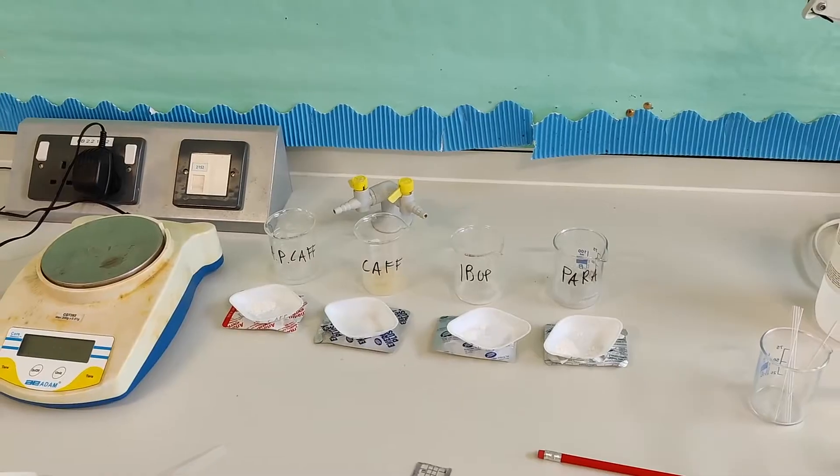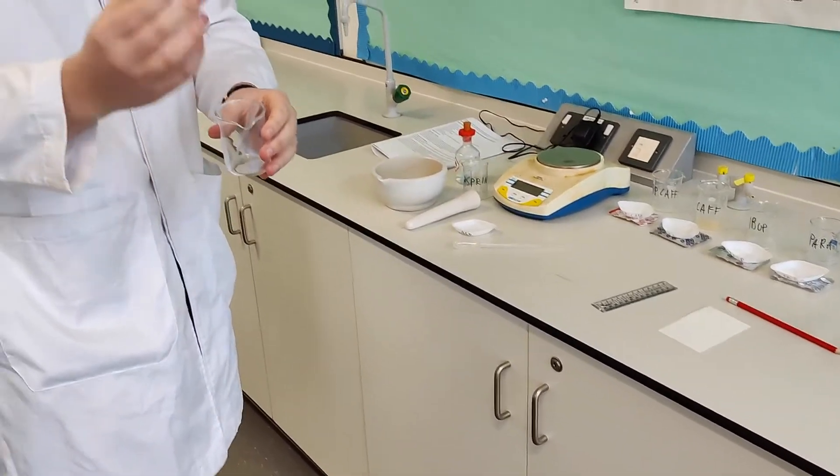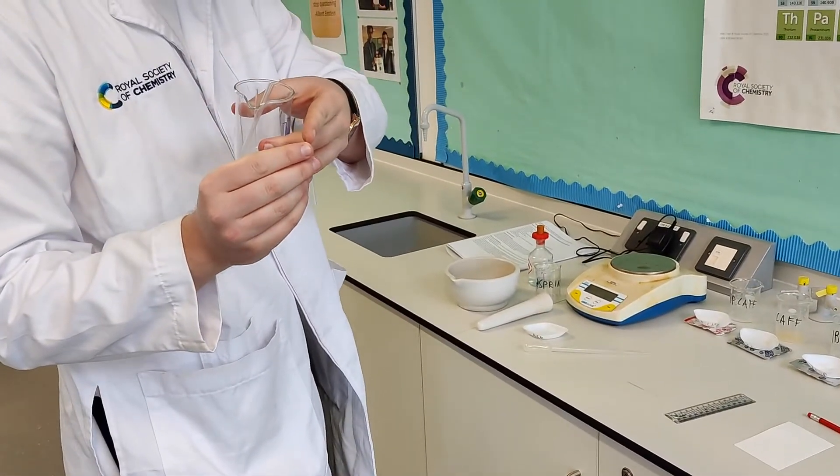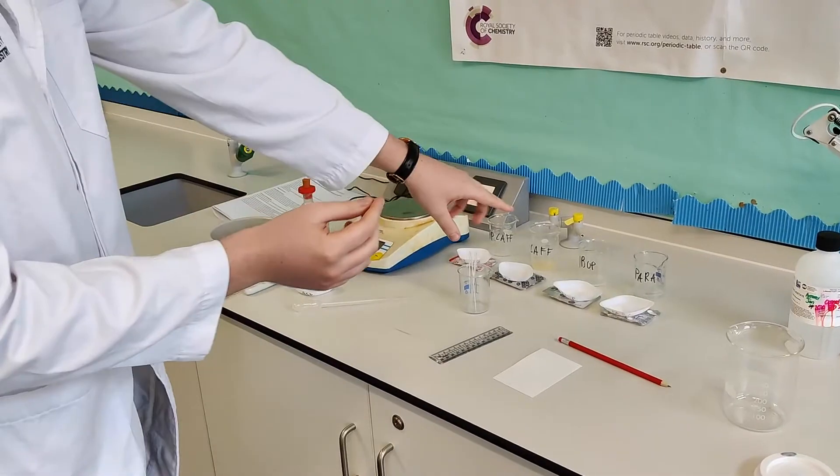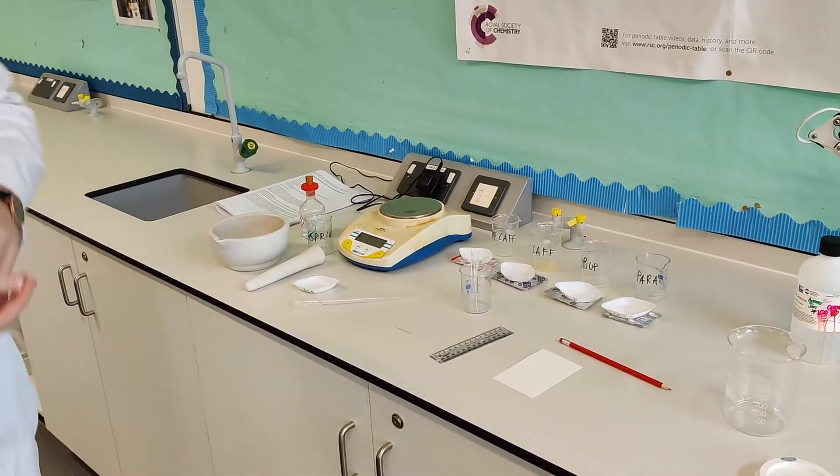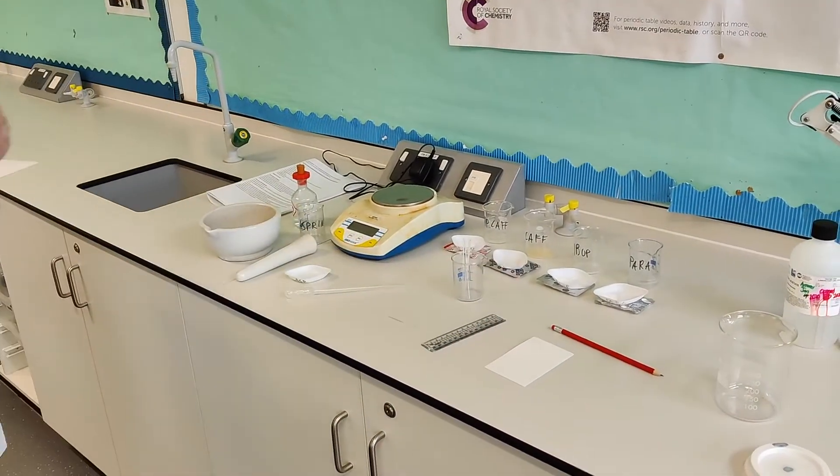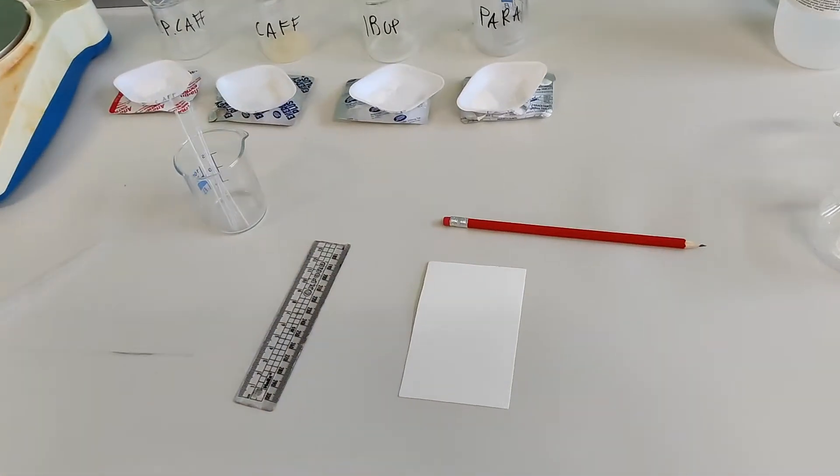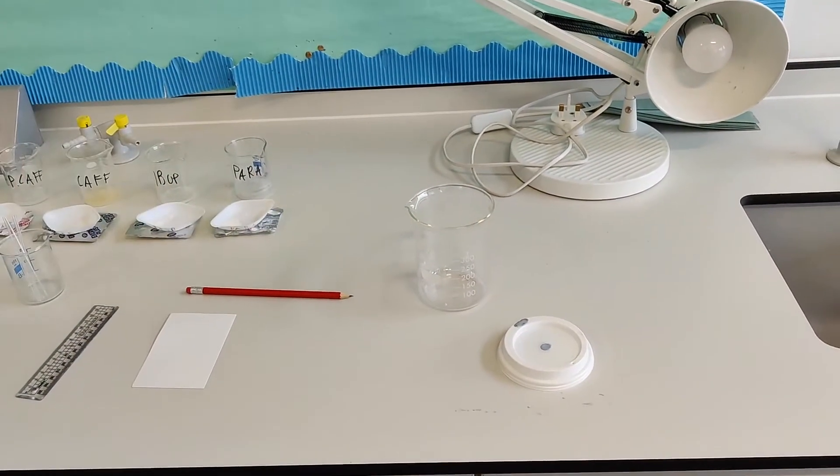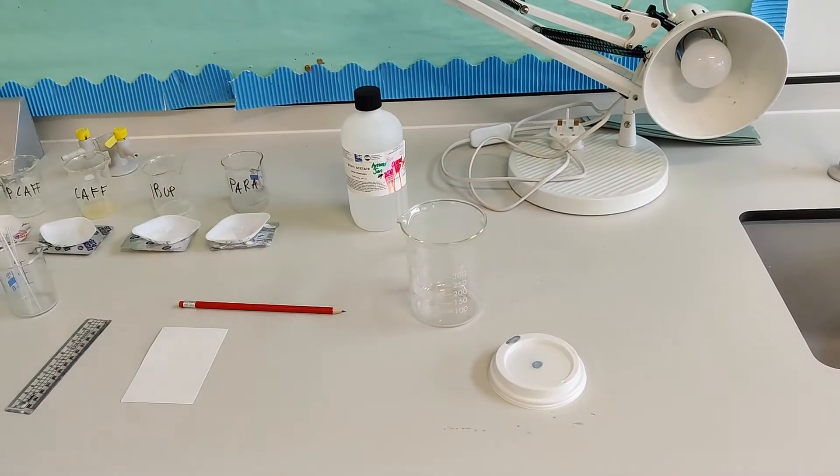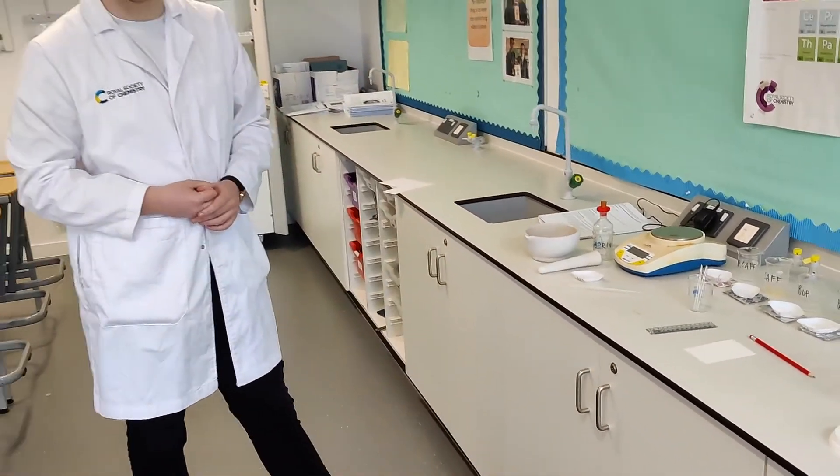And then what do we do once we've prepared all our samples? So once we've prepared them all, we're going to get a capillary tube. Remember these capillary tubes are very, very thin and fine with a small opening at the bottom. We'll be dipping this capillary tube into the solution, and some of the solution will be drawn up the capillary tube by capillary action, and then we'll be spotting a small dot onto the TLC plate, and we'll be placing all of our spots on the TLC plate, and place it in the beaker with a solution of ethyl acetate as a solvent, and we shall see a nice separation of different compounds in each of the different drugs.